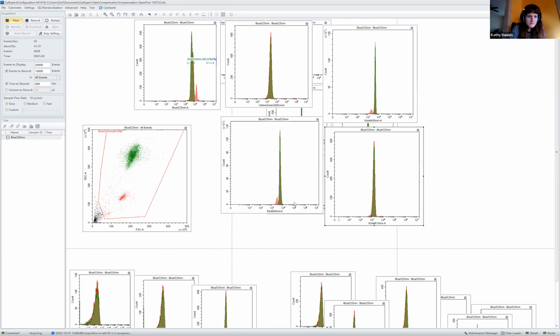All right. Apologies, a little difficult on the screen. Oh. All right, adjust that a little bit. I'm just trying to optimize this display for these histograms. Okay.